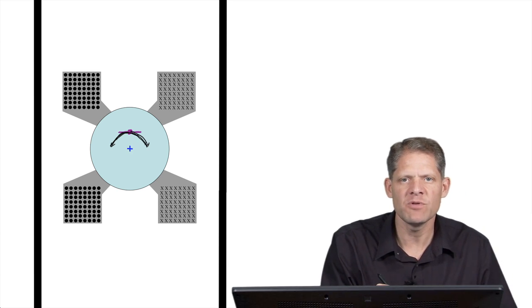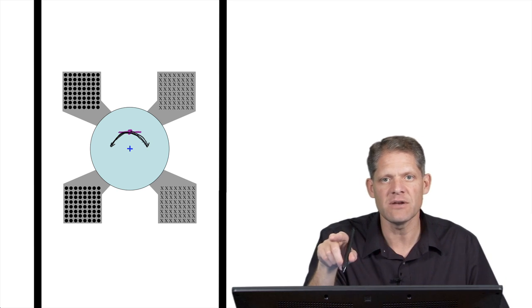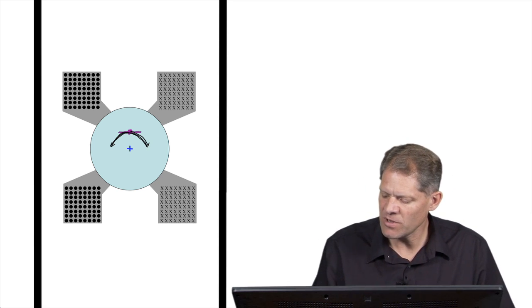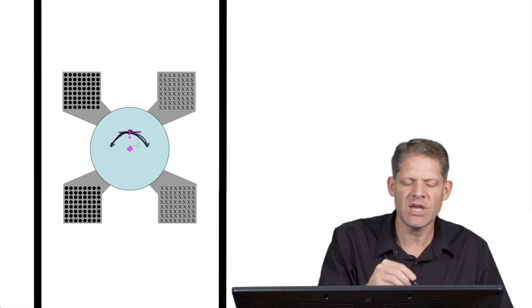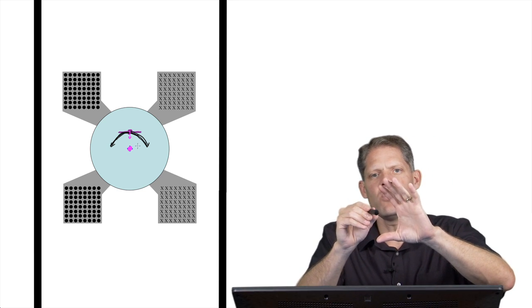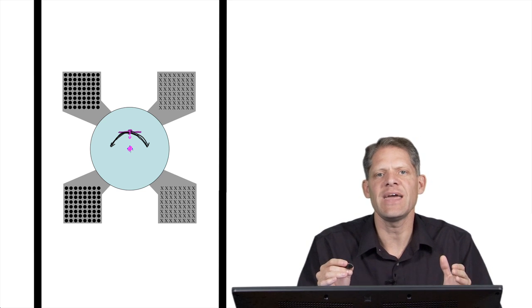And because of that, we would see the image of the sample move back and forth across the screen. But as we lowered the sample, we could move the sample down, and eventually when the sample was right here and we rotated the goniometer, it wouldn't move at all. And that position then is called the eucentric height.